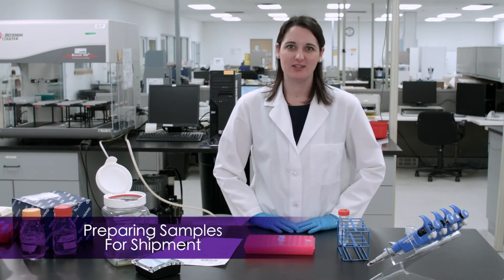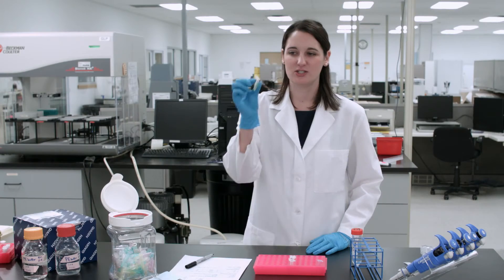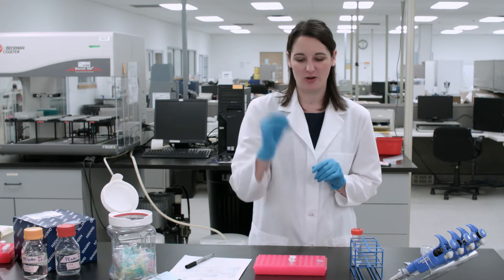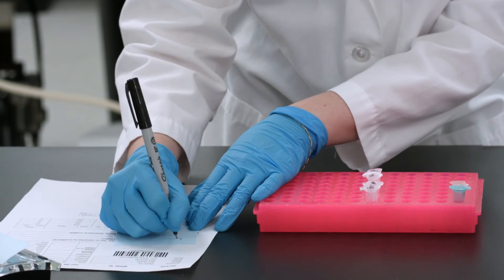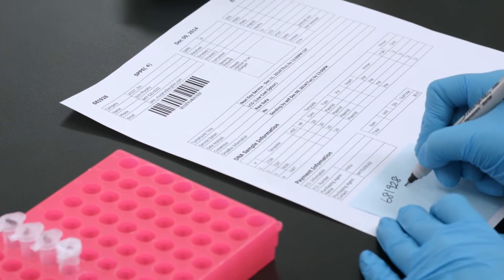We are ready to prepare our samples to be shipped. In order to prepare your samples, please use a sturdy micro centrifuge tube, preferably a transparent one. Grab a post-it or any small piece of paper and write the order number on that post-it note.